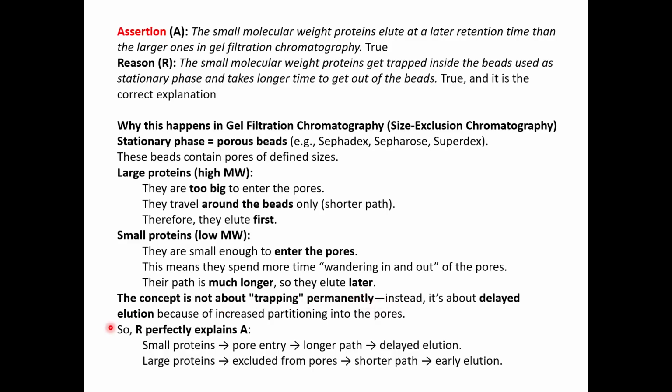and their path is much longer and they elute later. So the concept is not about trapping them permanently, but about delaying the retention time. You might think, what if they enter the pores and then you lose your protein? Your protein doesn't come out if it is of smaller size? But no, you will have your elution later where you will use buffers and you can elute them out from the pores easily.